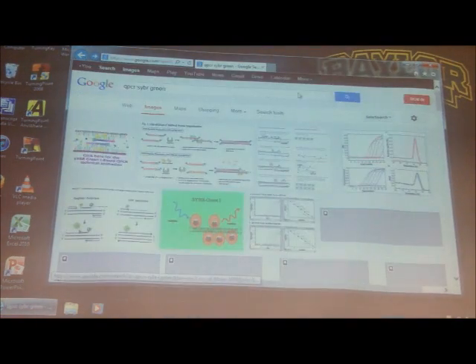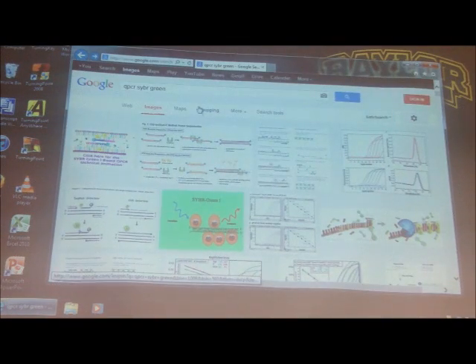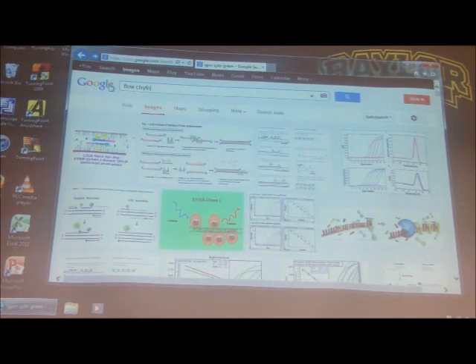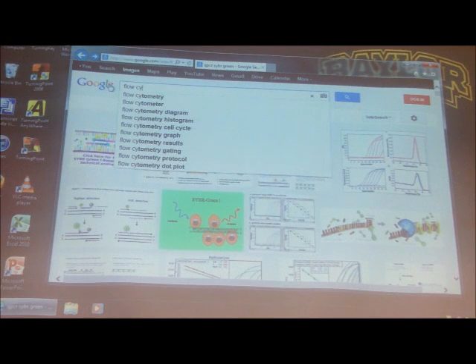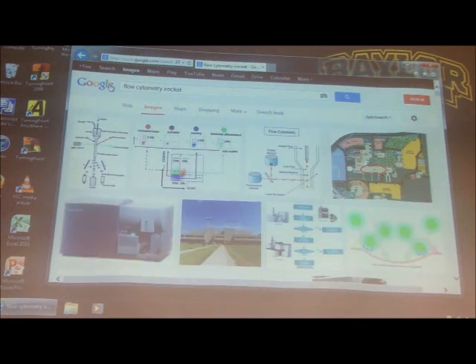So let's move on then to flow cytometry. And I found a really good site for this at University of California, San Francisco. Just for their training, they have something called iRocket. And so we'll go and study flow cytometry from iRocket.